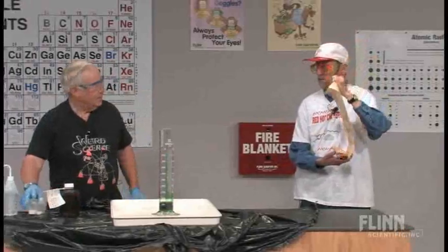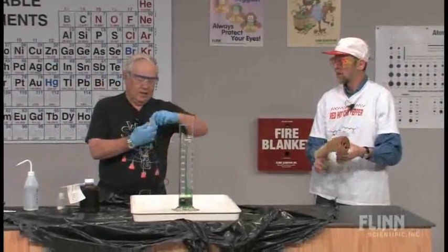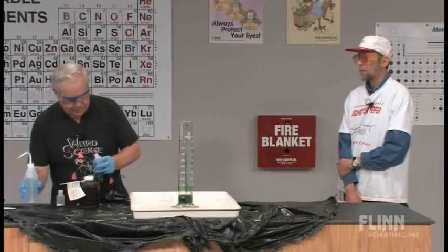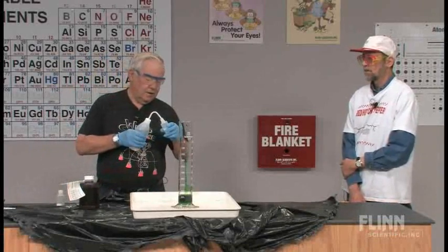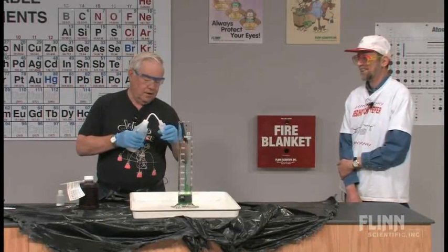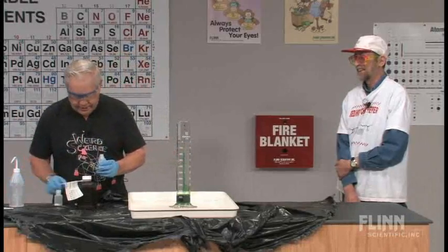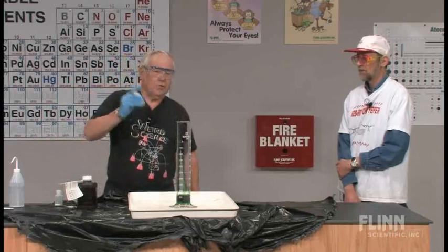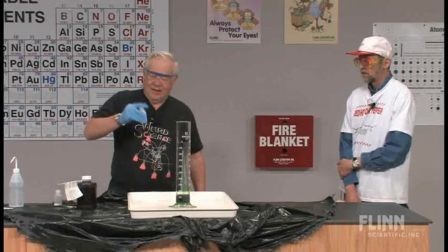So is this piece of paper going to fit in that? No, I'm going to have to activate it with one over here. This right here is some sodium iodide, and I'm going to make a solution that is pretty saturated right now with that.